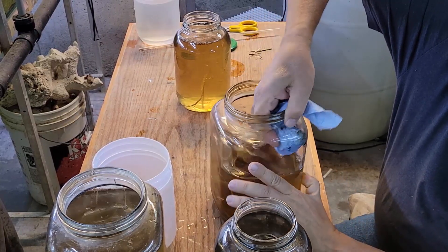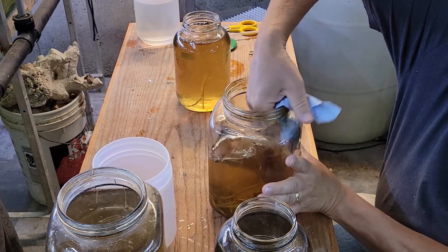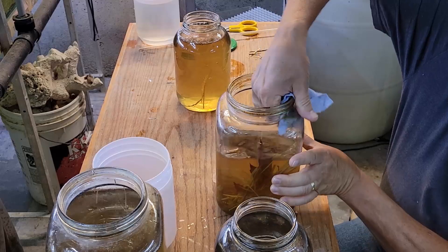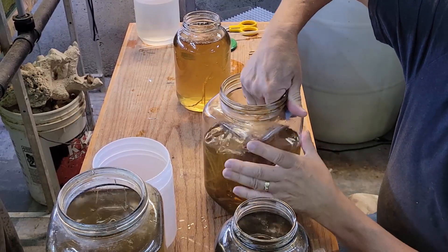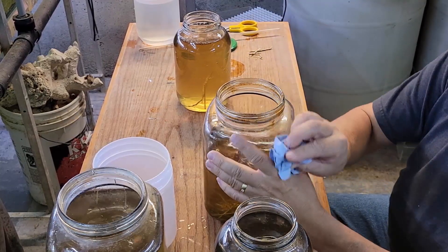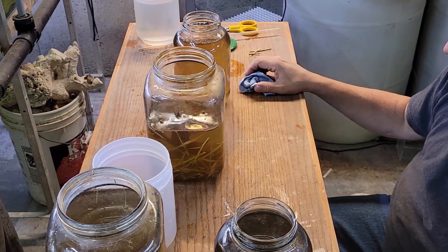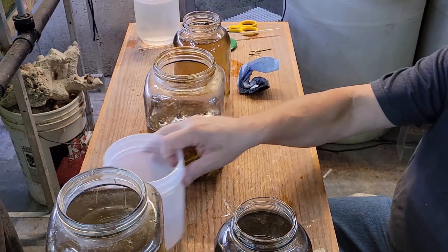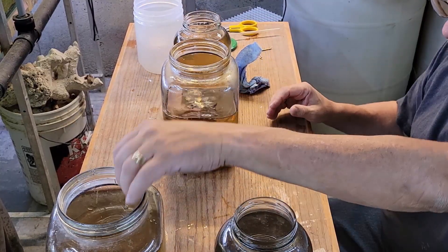I don't do this every day. This is a weekly process if I remember and if I have the time, and if I don't, every two weeks for sure. I also, from time to time, will completely empty a jar out, clean it out, remove a lot of the material that has already gone through the rot process because it just becomes basically inert organic material and it's not really doing anything for the culture.